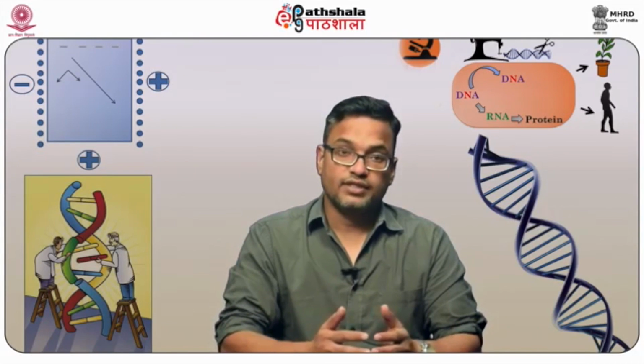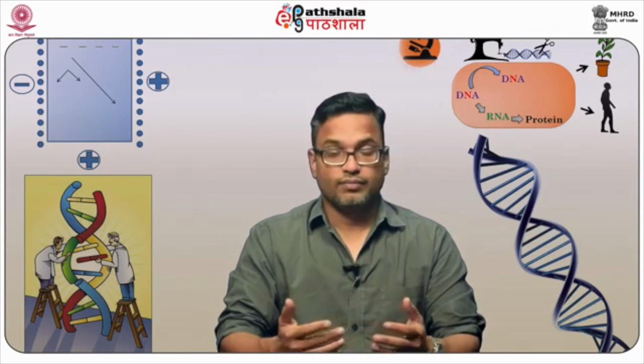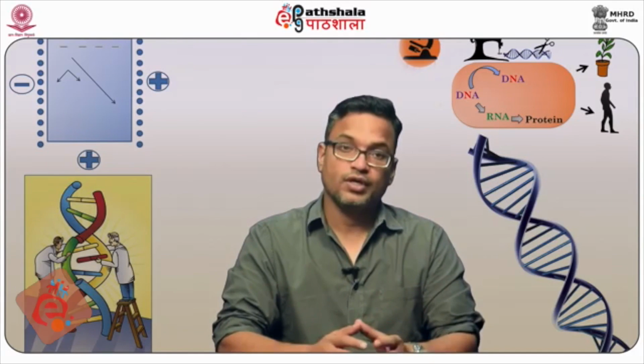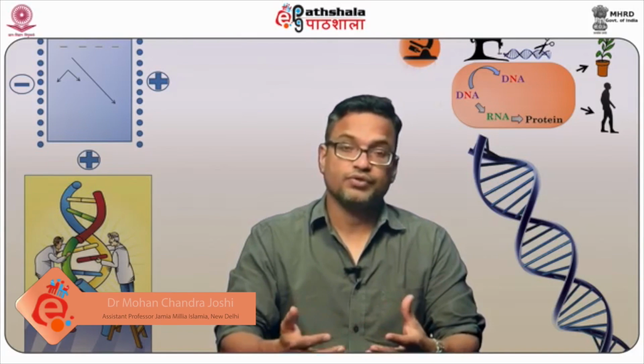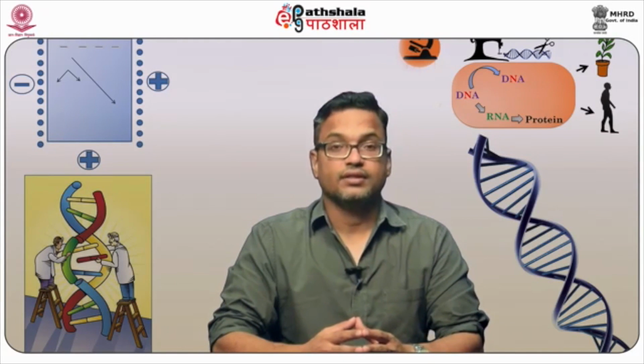And then, as I mentioned, as the technology is advancing over the period of time, new modifications have been adopted in microscopy to give you better results, better reproducibility, and better application in biological research.